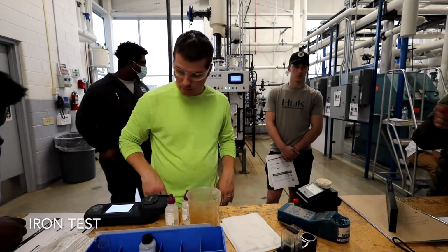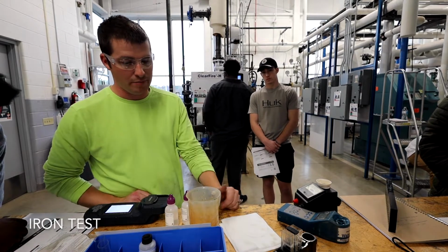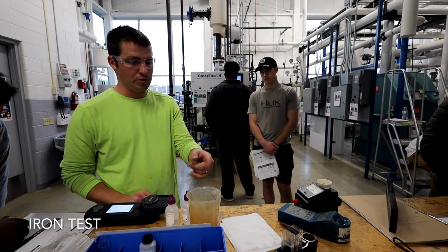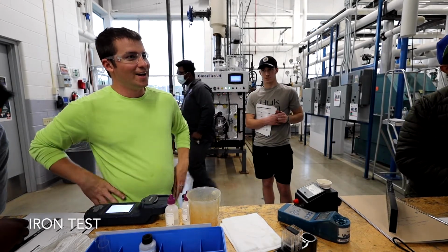How long do you have to wait? 5 minutes? This is a 3-minute test on mine. This one's saying 5 minutes. And again, it could just simply be, well, you've got to wait the 5 minutes. Yes.